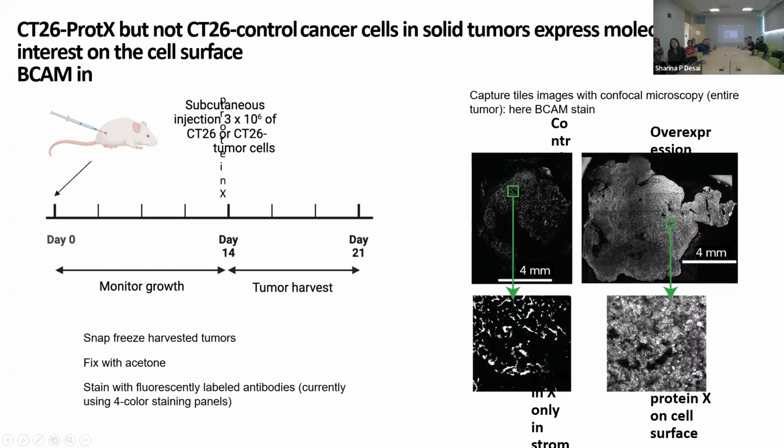You can get a really high resolution, but then it takes forever. When I do a pretty high resolution, I think it's 0.3 micrometer per pixel, or the other way around. I should know that, but it's a pretty good resolution, and that will take you like 10-15 minutes for a tumor of that size. If you want to go with the maximum resolution, it takes long, but it's really not necessary.